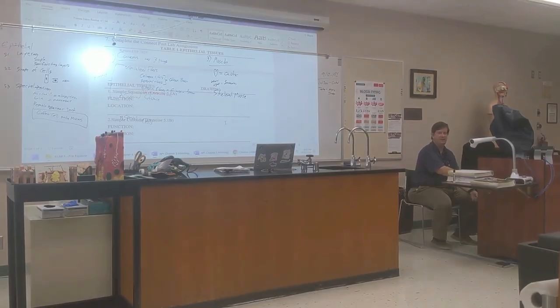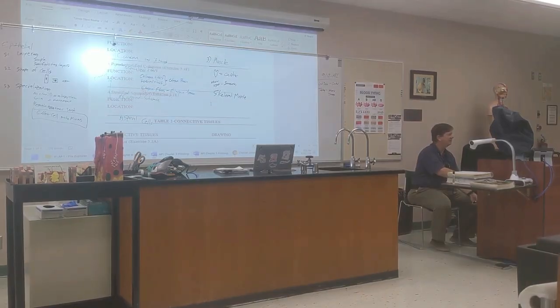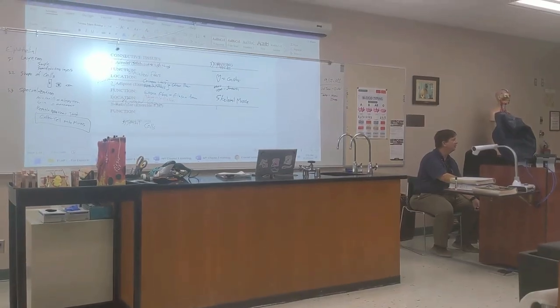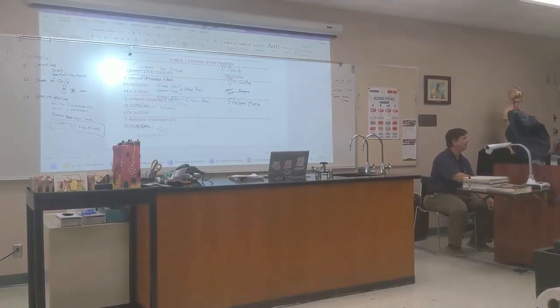Does that make sense? Like, they have transitional epithelium. I might talk about it. I may put it on a full lab test, but I'm probably not, because these are the 4 they're really hitting on for epithelium. These are the ones, let's see, 1, 2, 3, 4, 5, 6. These are the 5 that they're really hitting on for connective tissues.